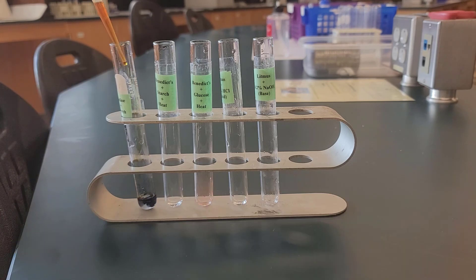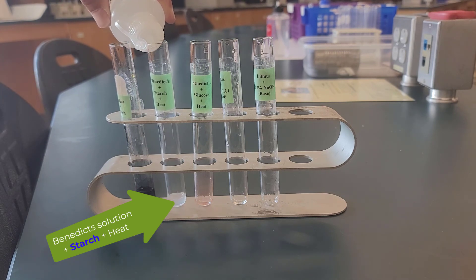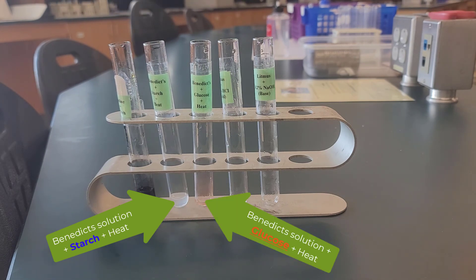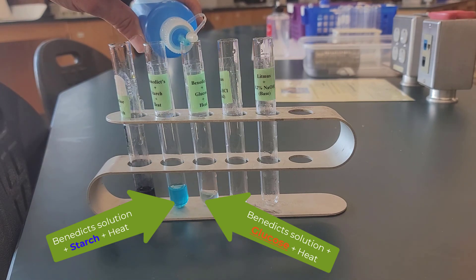Test tube two: we're going to put Benedict's solution, starch, and heat. And in test tube three: Benedict's solution, glucose, and heat. When we first do this without the heat, you'll notice that both of them are blue. We're going to come back to that in a minute.